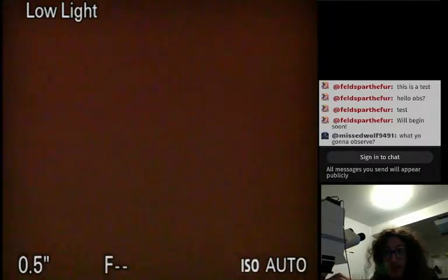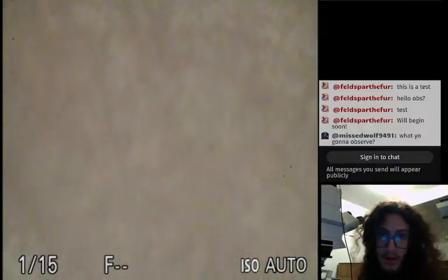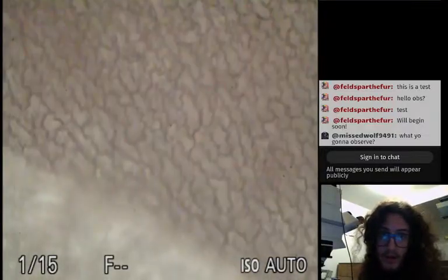And we're gonna focus in. Okay. It's really interesting how you can see the barrier between the colory part and the not colory part really well. Right here's a really pigmented part.